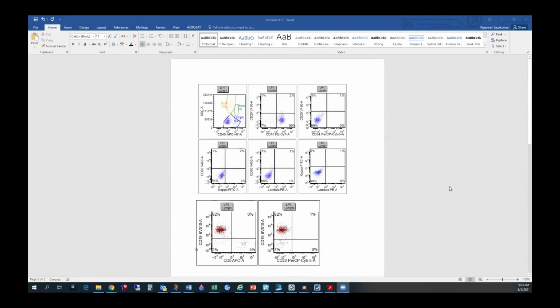This is a real case. This was my case. The patient had a history of follicular lymphoma treated, and they did the bone marrow just for follow-up. And I see some CD45 dim population. The blue population is CD45 dim, which is strange. Do we have a plot of CD10 versus CD20 somewhere? We do have this one.